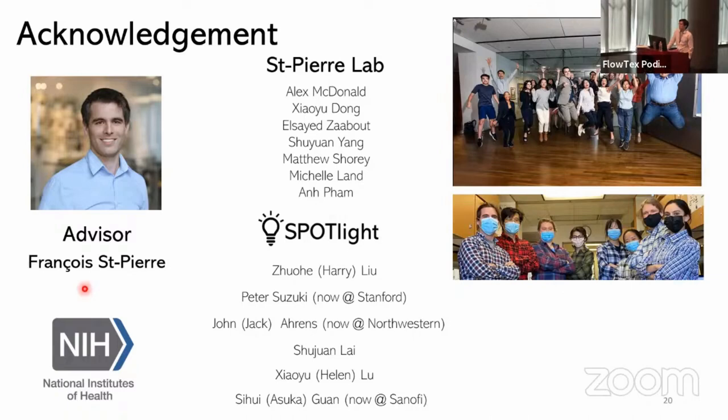So in our publication, for optical tagging of individual cells, it took around 45 to 60 seconds per cell to do the labeling. So then you can scale that to the number of cells that you want to isolate. In the recent version of our hardware, we reduced that time to 1 second. So it really depends on how many cells you want to optically tag.